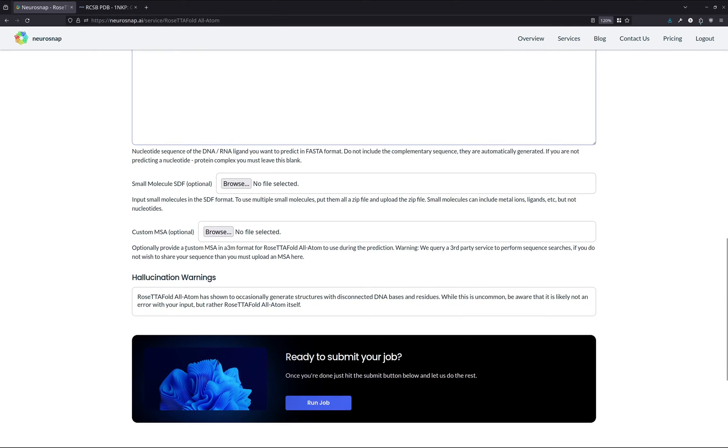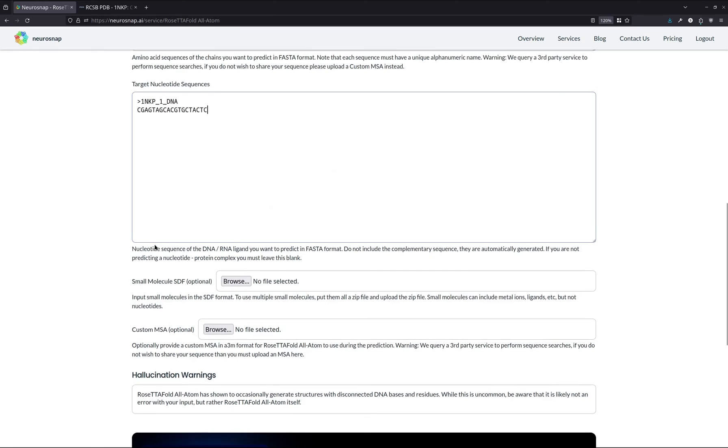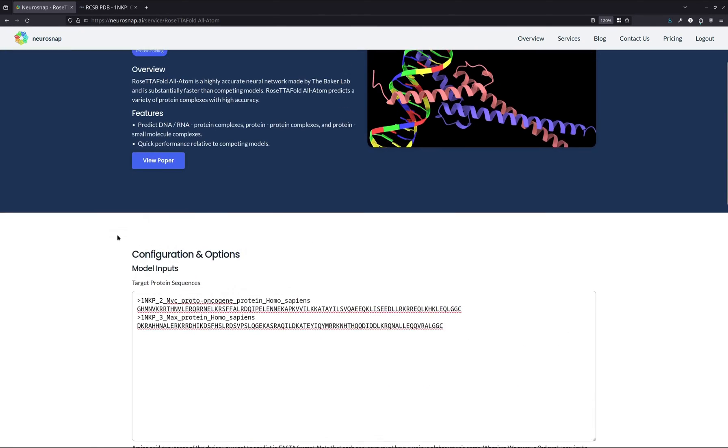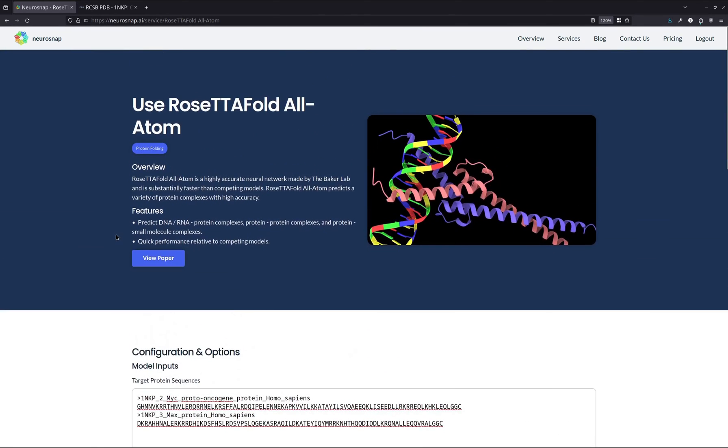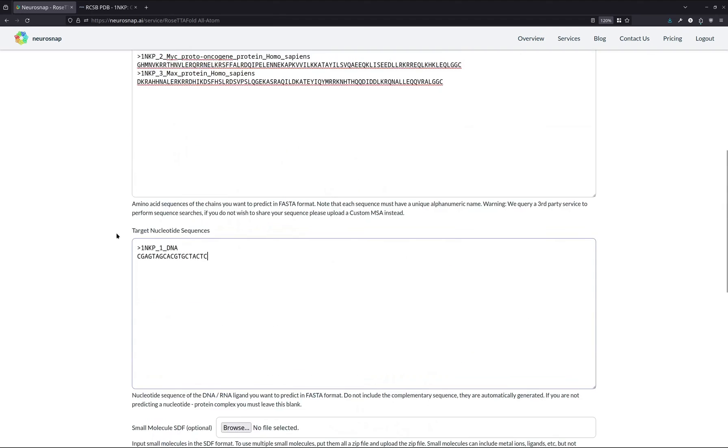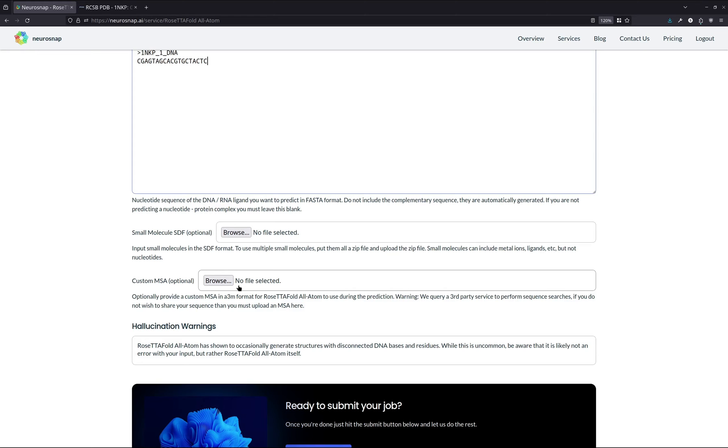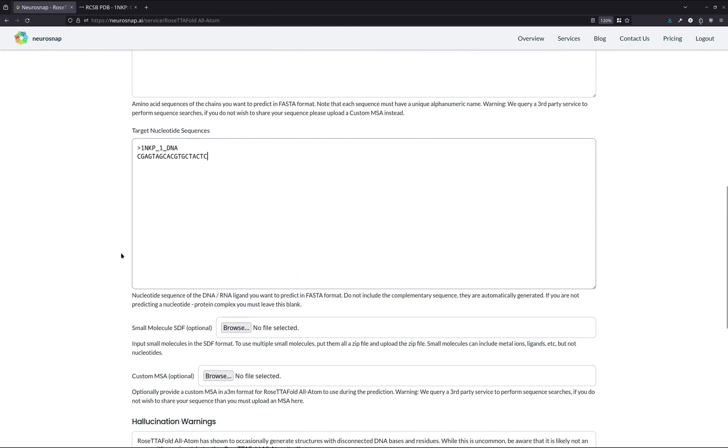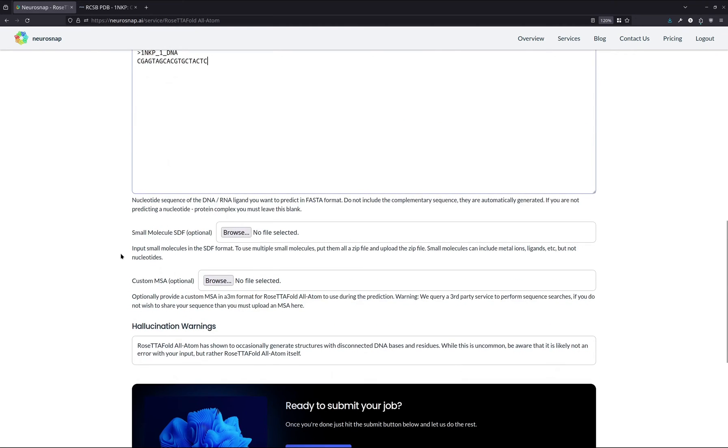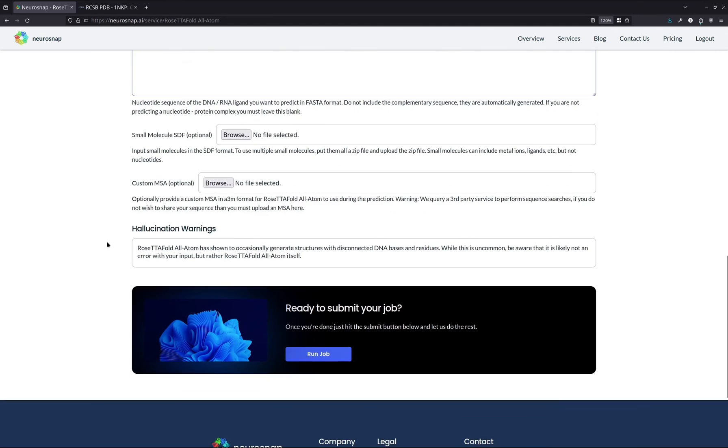As for a custom MSA, protein structure prediction models like this one as well as AlphaFold2 typically depend on co-evolutionary information that's found and extracted through MSAs. So if you want to provide your own MSA, then we have the option for it over here. If you don't want to provide an MSA, that's fine. We will generate one using the ColabFold API. And generally, we find that the results from the ColabFold API tend to be very good.